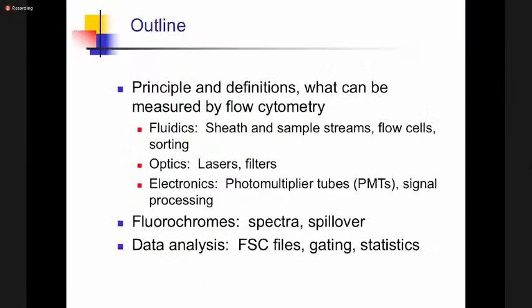And why do I do that? To make you get a distinction on the components of flow cytometry, that it has got the fluidic component, the optics component, that laser light which is subjected, and then the electronic component, which means the signal processing from the excited light. Then for you to get this signaling, there must be what are called fluorochromes, which means the dyes which are used to label these cells or the markers on the surface of this cell.